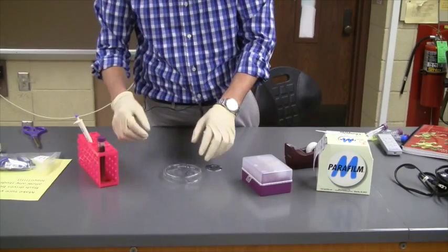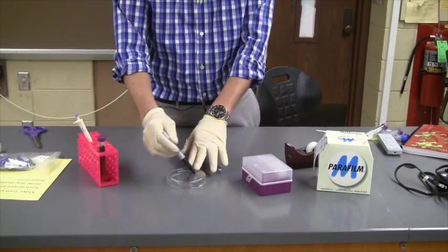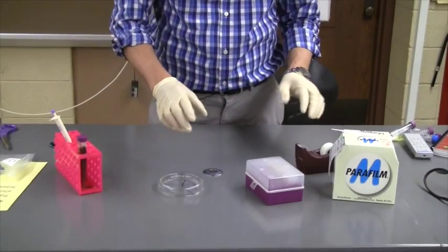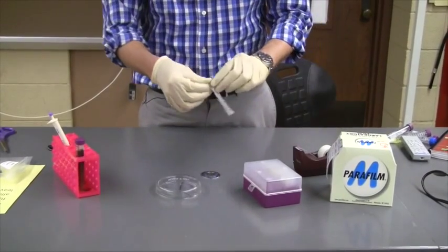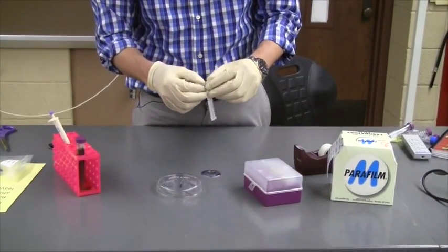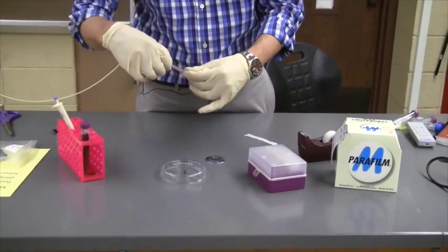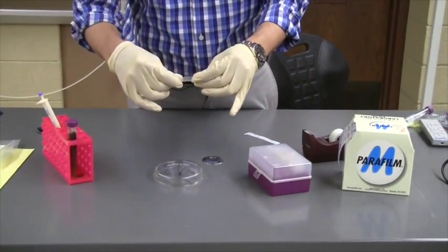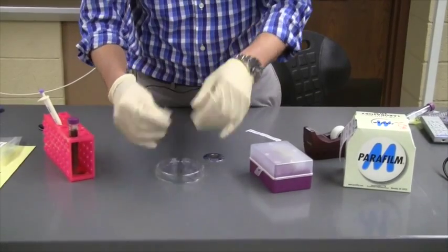To seal the plate once you do that, you may want to write your name and your group number on the lid. To seal the plate, you can then use parafilm. Parafilm, like I said, is sort of a stretchy wax-like paper or film, I guess.